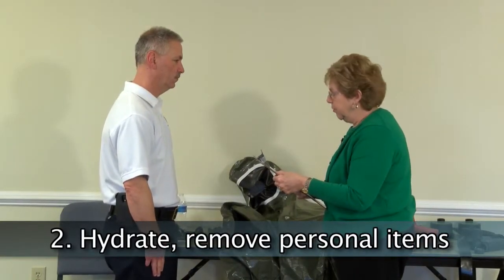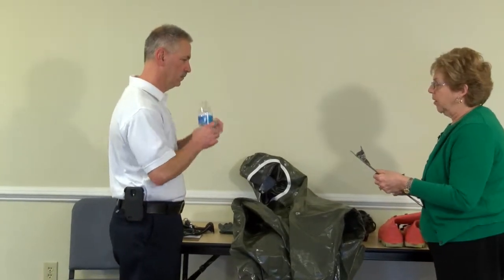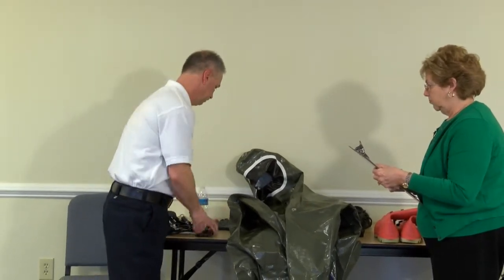Hydrate prior to donning PPE. Workers tend to get very warm in PPE and can dehydrate easily. Also use the restroom if needed prior to donning PPE.